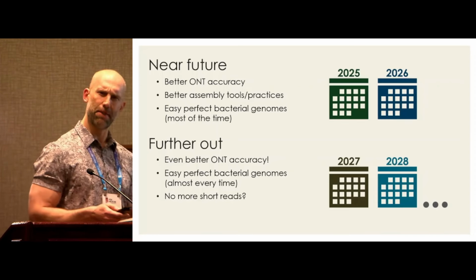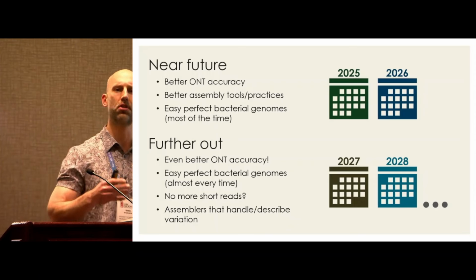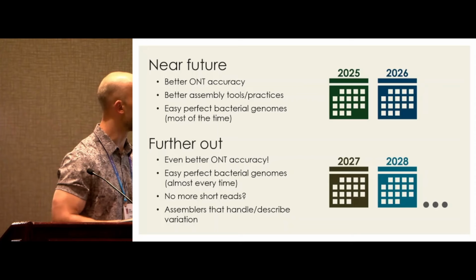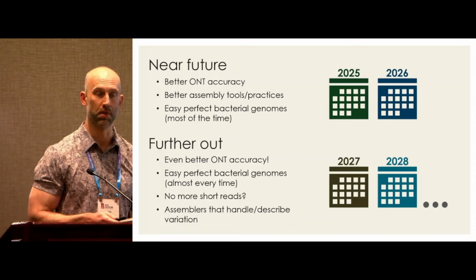And then I think maybe the final frontier for bacterial genome assembly is, remember I said at the start, there can be dynamic regions of the genome, there can be variations. Let's just go with the majority variant to keep things simple. Well, I think assemblers and tools that really characterize what's happening in those dynamic regions, and don't just throw out the minority variants, but include them and describe them, that's going to be very useful. It's going to be incredibly useful for metagenomics, where this variation is so common, and I think that will be the next big frontier that will give us a lot to work on.